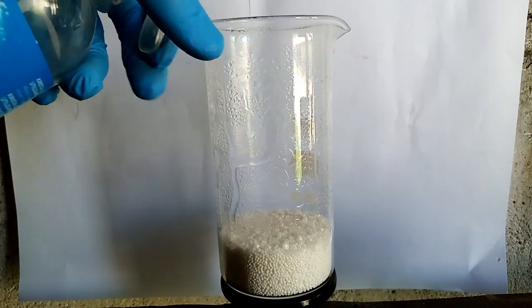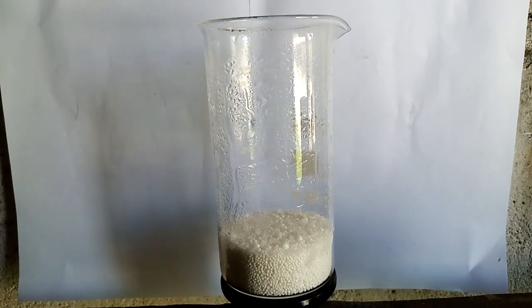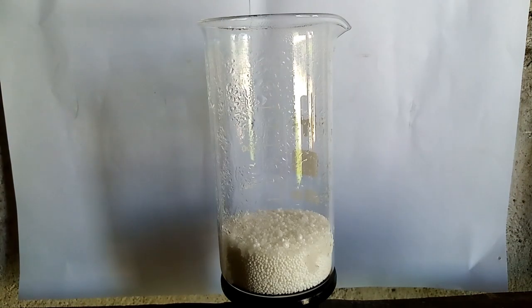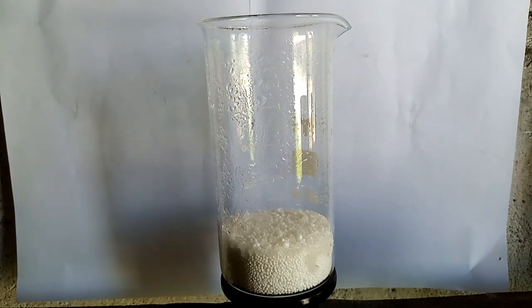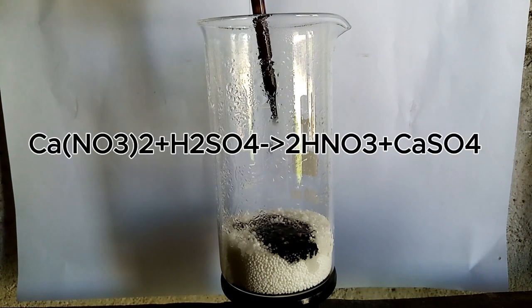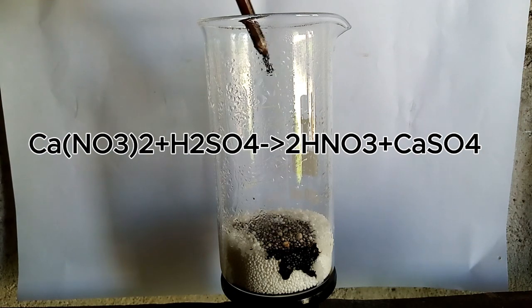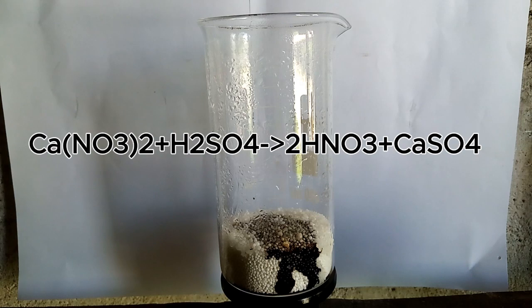After I spray out some water on the calcium nitrate, it's time to start the reaction and add the sulfuric acid. What is happening in the reaction? The calcium nitrate reacts with the sulfuric acid and forms nitric acid and insoluble calcium sulfate.